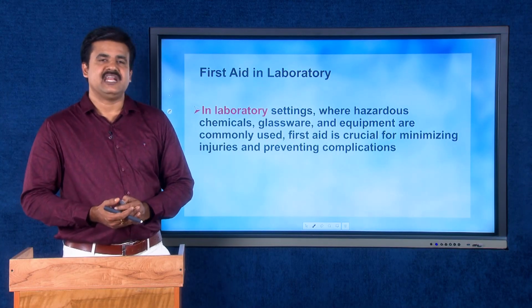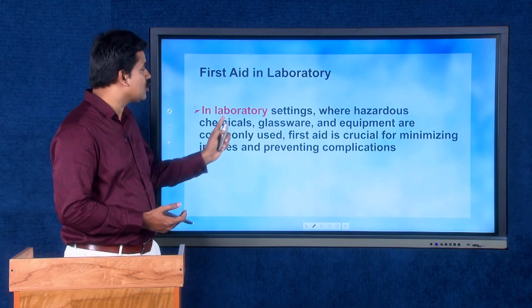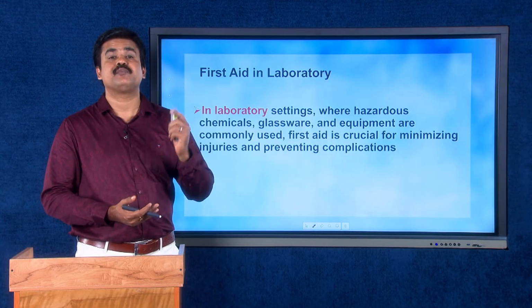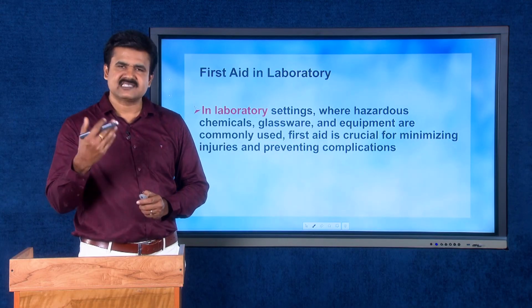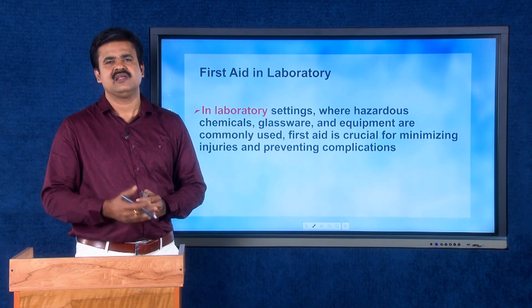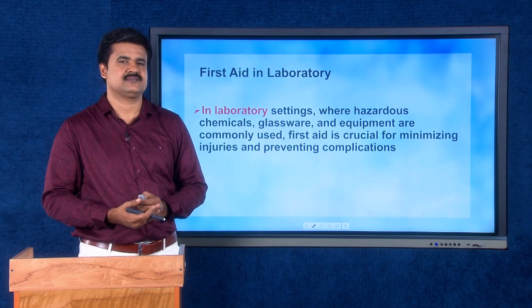First aid in laboratory. In laboratory settings, where hazardous chemicals, glasswares and equipments are commonly used, first aid is crucial for minimizing injuries and preventing complications. Suppose a person is subjected to burning from sulfuric acid or bromine or some other toxic chemicals. We have to give first aid, and that may prevent further burning and further complications.